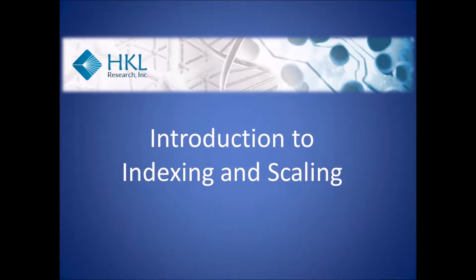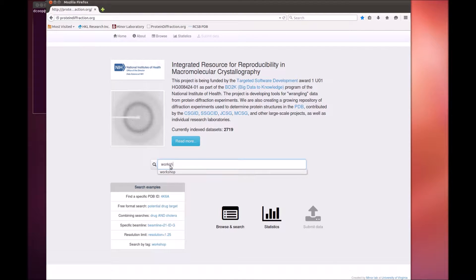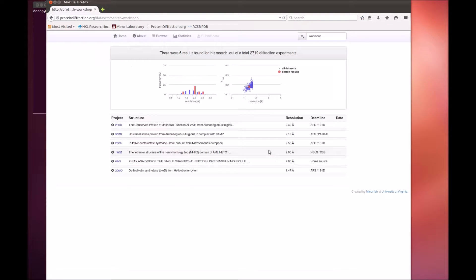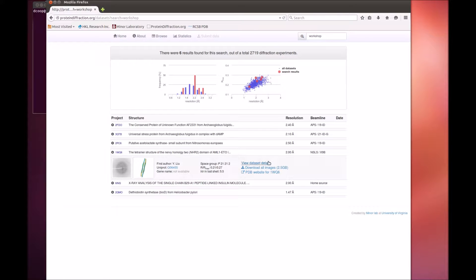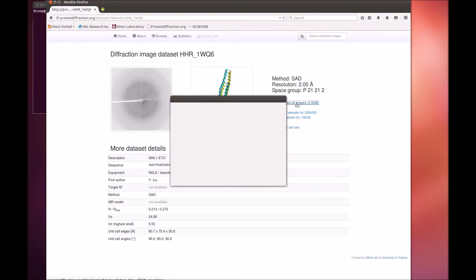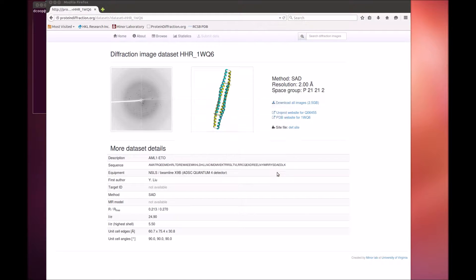Welcome to HKL Research's Introduction to Indexing and Scaling of Crystallographic Data using the HKL Suite. The data for this tutorial is available at proteindiffraction.org. Search using the keyword workshop to find several excellent training data sets. The one we will work with today is that of 1WQ6, the nervy homology two domain of ETO.